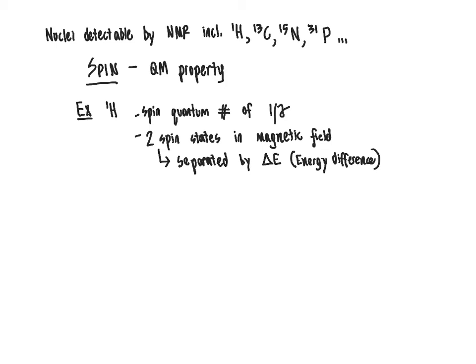And looking at this schematically, this spinning in these two different spin states that are separated by an energy difference delta E is going to occur exclusively when the hydrogens are in a magnetic field. This will be occurring in a predictable manner. And so we can plot this out here as a schematic, that if we had a proton in no magnetic field, we could plot the energy right here as this bar that I'm drawing in blue.